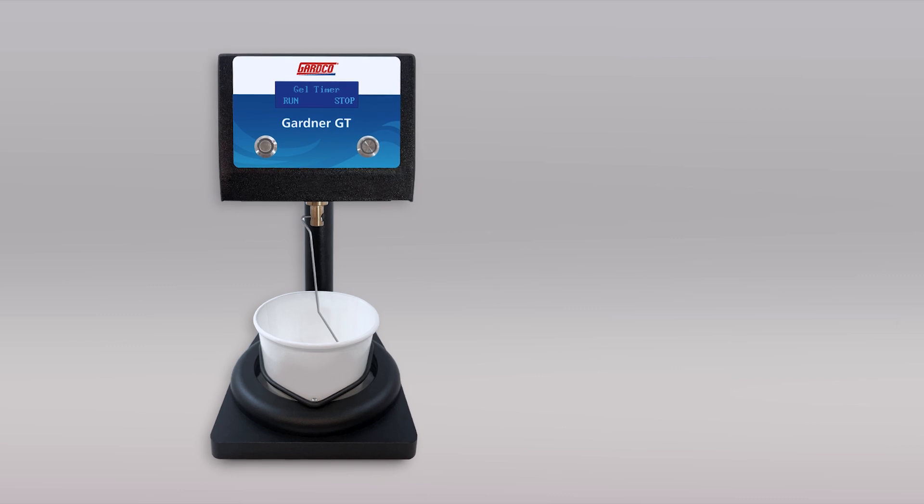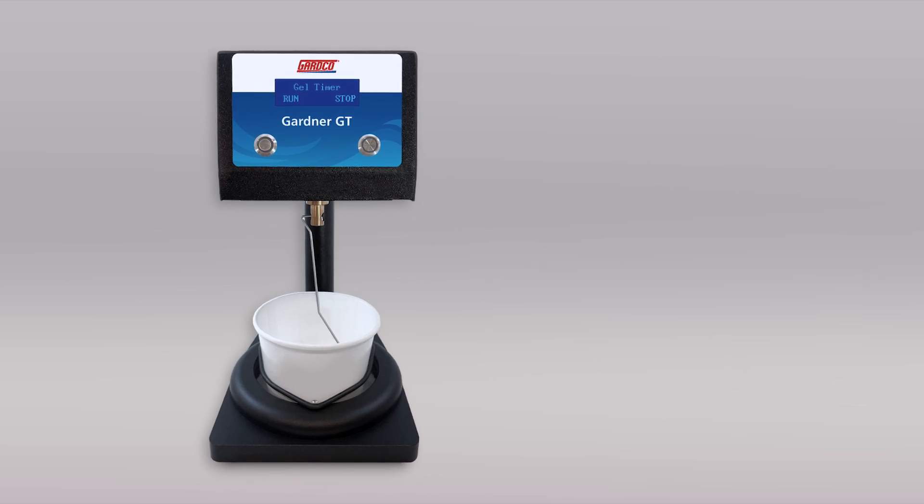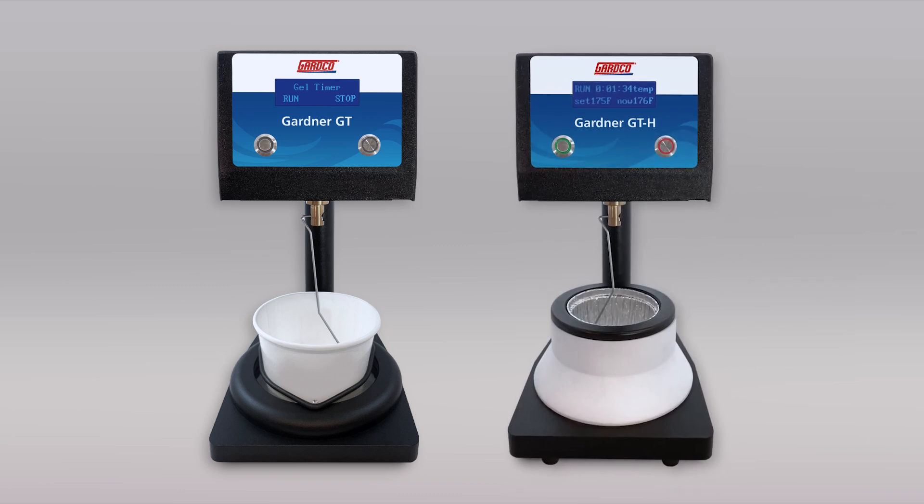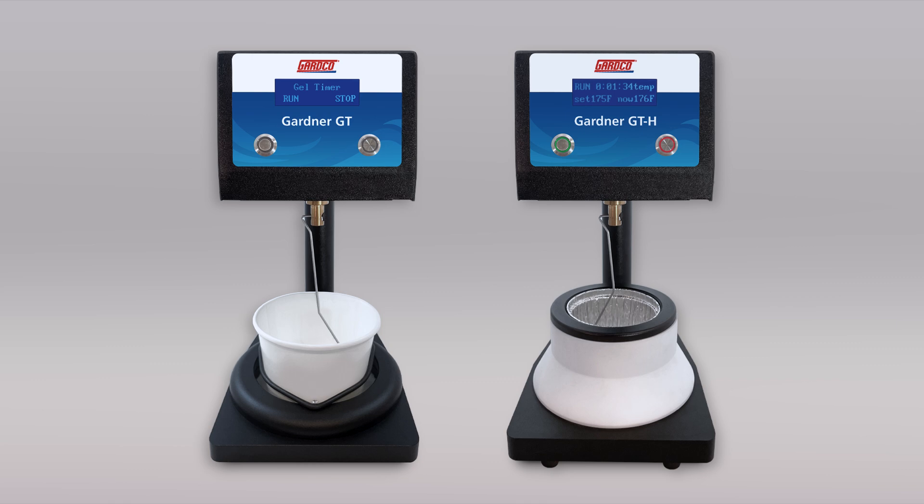Guardcoat gel timers are available in two different models. The standard gel timer offers simple gelation tests at room temperature or in a shop setting. The hot pot gel timer features a wider temperature control range for unparalleled repeatability and accuracy.